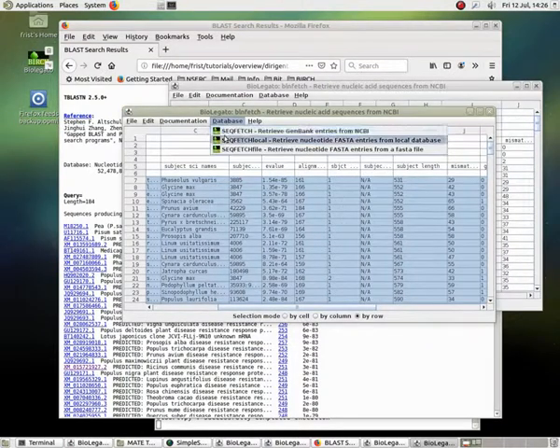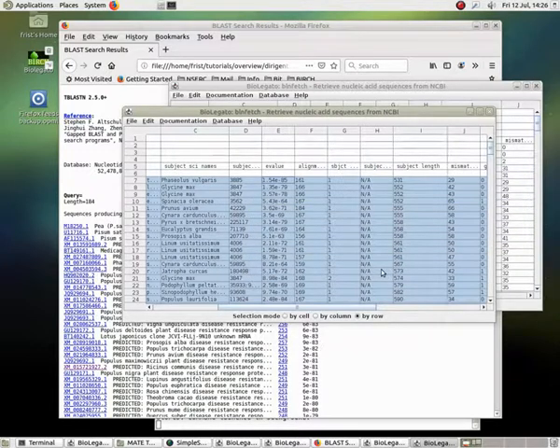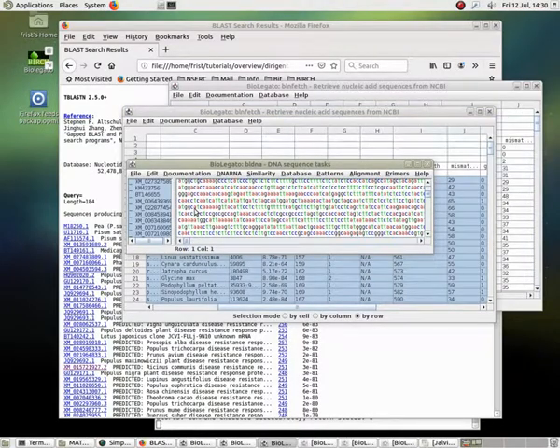So if I want to get these sequences from NCBI, I run seqfetch, which will retrieve the DNA sequences into a BLDNA window, which is yet another BioLegato specifically for DNA sequences. So now you've got the basic idea behind ad hoc pipelining. For every step that we do, the output comes to a new BioLegato window specific for the type of data that we're working with. So we can quickly go from one step to another step and never lose the ability to keep working with data.